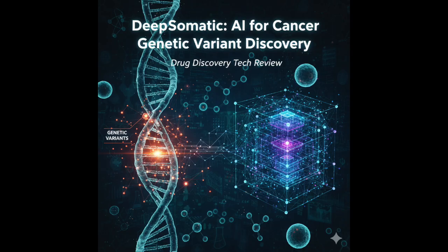It learns the subtle visual signatures that distinguish real somatic events from germline variants and from those structured sequencing errors like the FFPE C>T artifacts we talked about. Okay, the CNN makes its call. Then step 3, post-process variants, getting the results out in a usable format.